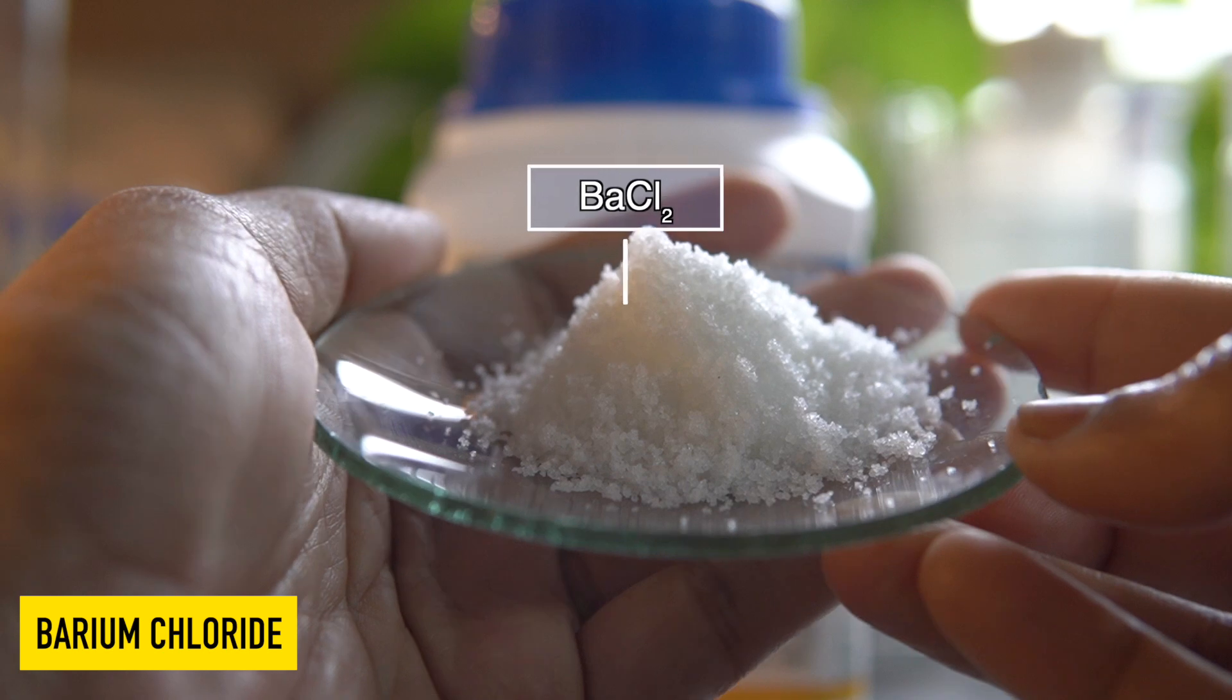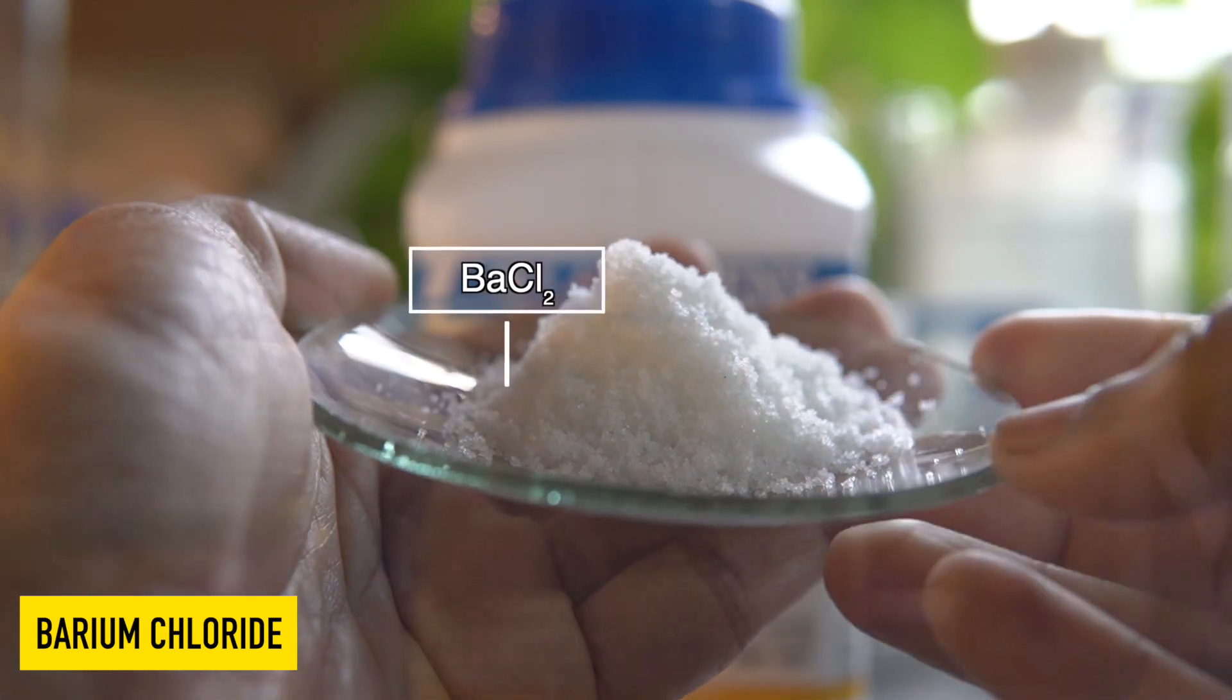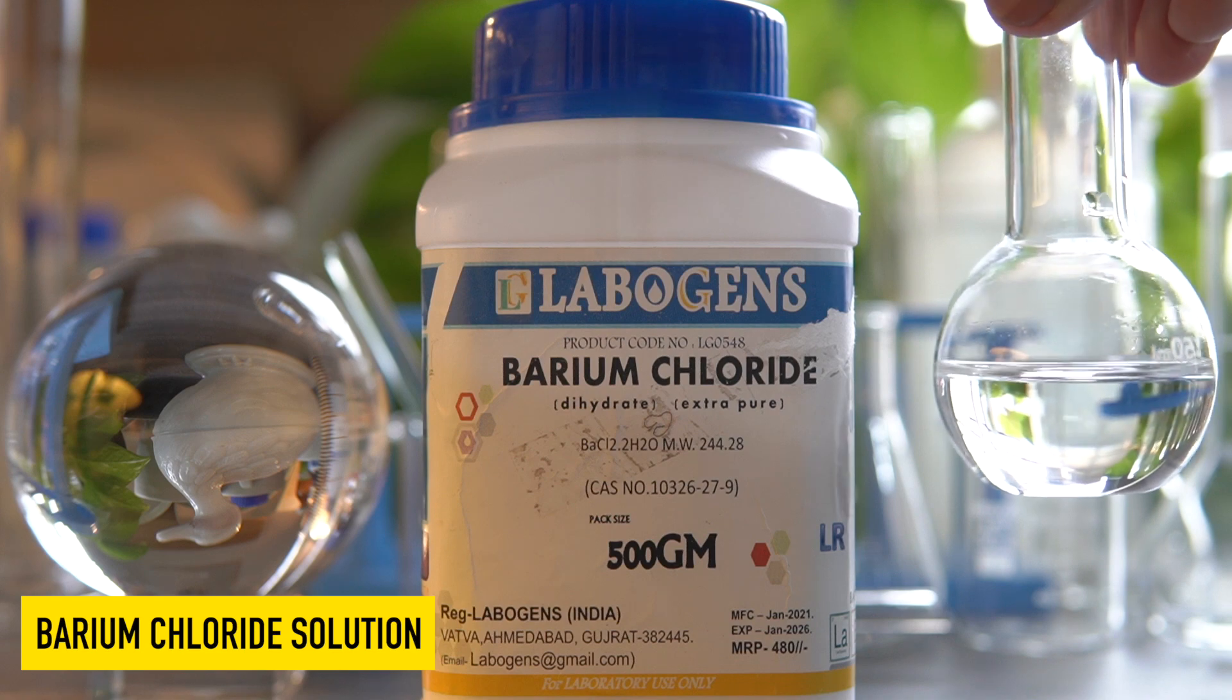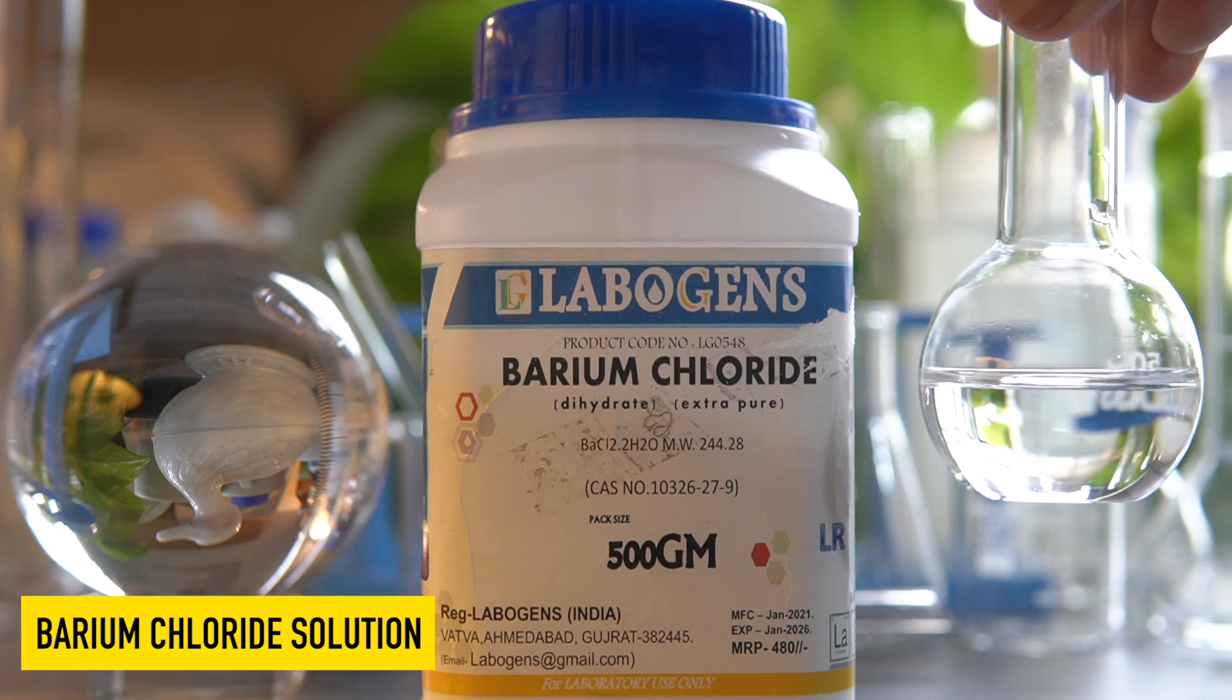This is barium chloride, a white crystalline solid. It can easily dissolve in water to make a homogeneous clear solution.